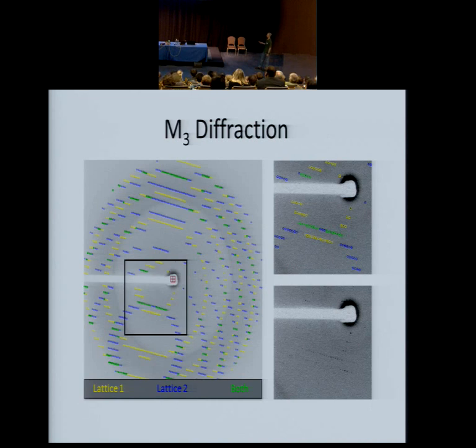And you can see that there are a number of positions where the spot is reflecting contribution from both of the lattices. And so when we actually try to integrate this data, it doesn't merge well and so on. The solution to this problem in this particular case was actually just a matter of finding crystals that had less of one twin. So we saw that in the crystals that we were collecting, the vast majority of them showed a very overwhelming preference for one or the other twin. They're about equally split between the 2 of them, but in most cases, a single twin was the predominant contributor to scattering on a given frame.